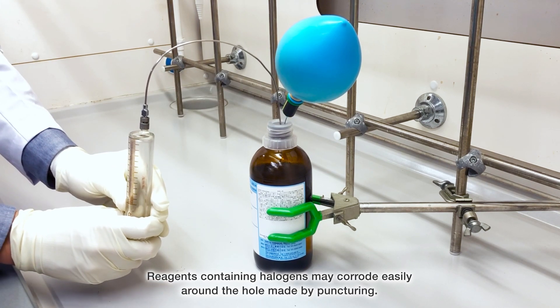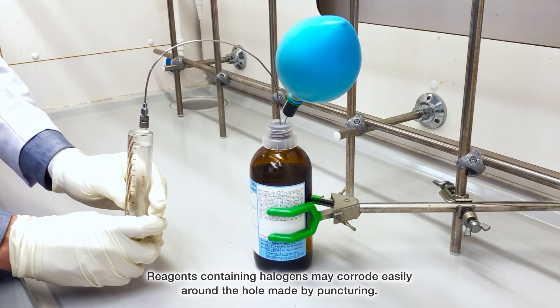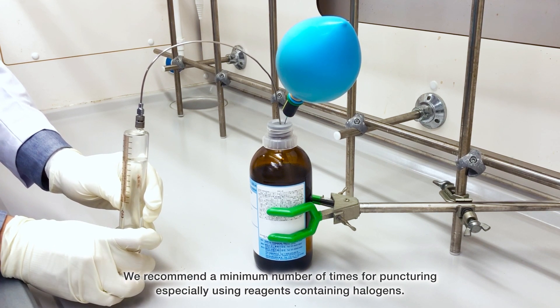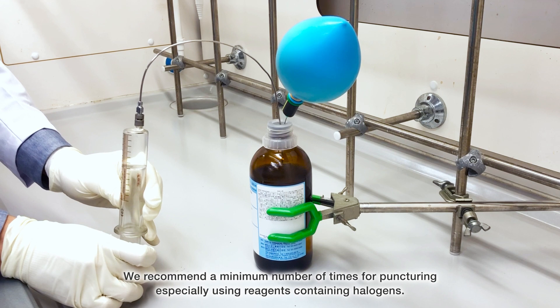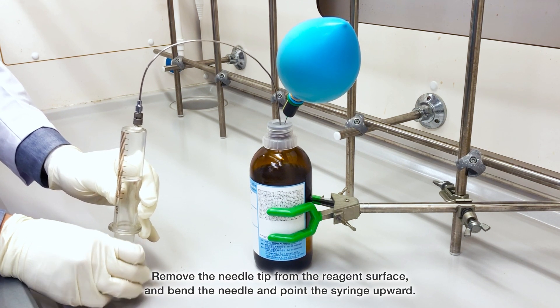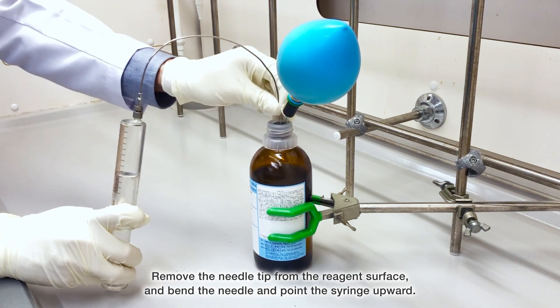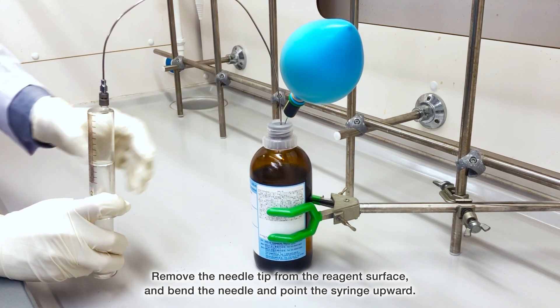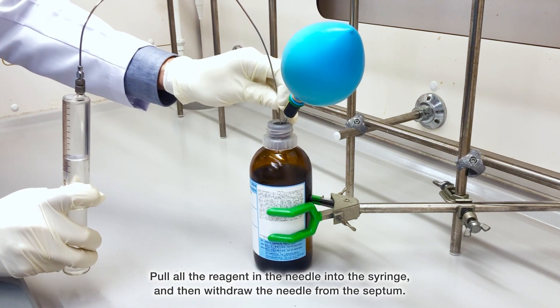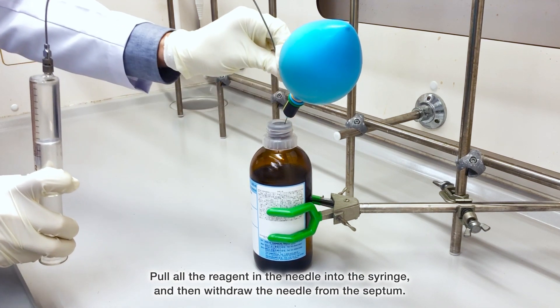Reagents containing halogens may corrode easily around the hole made by puncturing. We recommend a minimum number of punctures, especially when using reagents containing halogens. Remove the needle tip from the reagent surface, bend the needle, and point the syringe upward. Pull all the reagent in the needle into the syringe, then withdraw the needle from the septum.